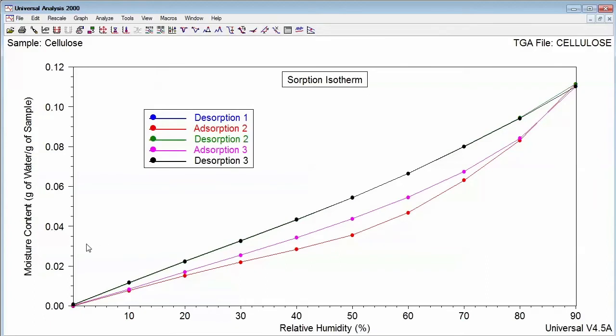As you can see, the new plot has a y-axis signal of moisture content versus relative humidity. The first and second sorption cycles, as well as the two desorption steps, are being displayed.